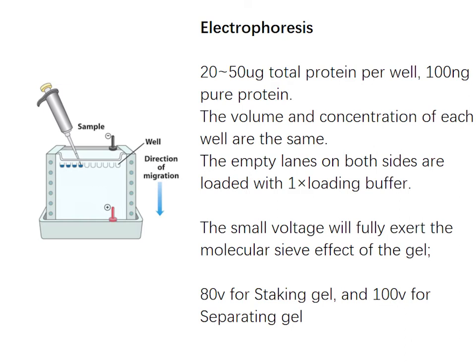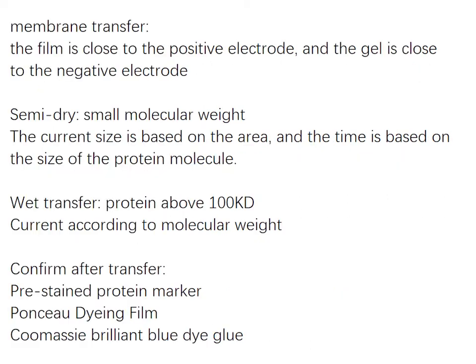If your protein samples have very small molecular weight, as the autophagy marker LC3 or the nucleus internal reference histone H3, you can only electrophorese to half the sheet of the gel to prevent horizontal spread of your samples. On the contrary, if your protein sample has the molecular weight similar to mTOR, you can let the bromophenol blue run out a little of the gel.